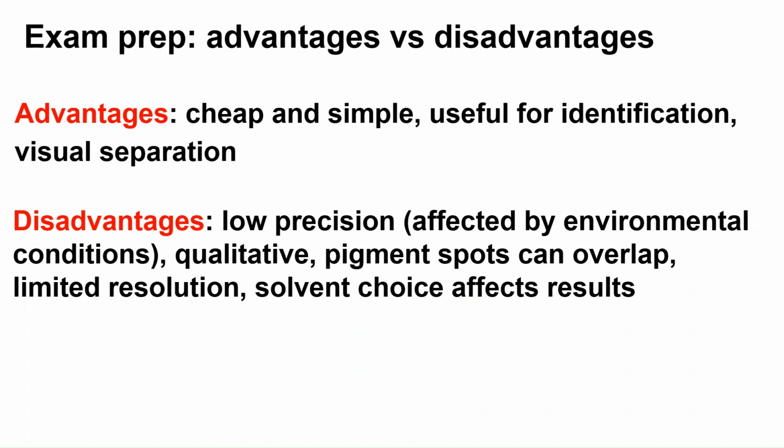It's qualitative as well, so you can't properly estimate all the pigments that are in the plant, just some of them really, and it's not totally accurate.